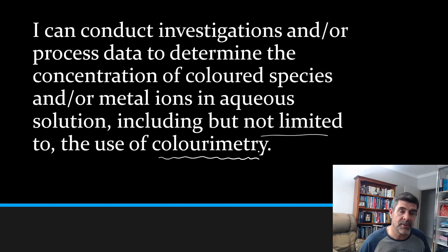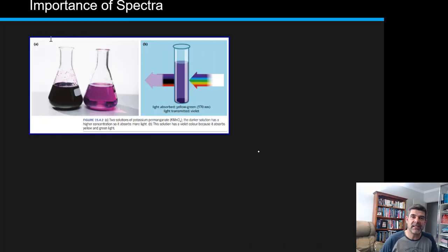Again, if you've got a colorimeter available, and we've been struggling to get hold of one, but we will be able to at least demonstrate this process, give you a chance to have a very quick look at the process of colorimetry, and we'll just quickly look at some of the theory or background behind colorimetry in this video. So basically this is it.